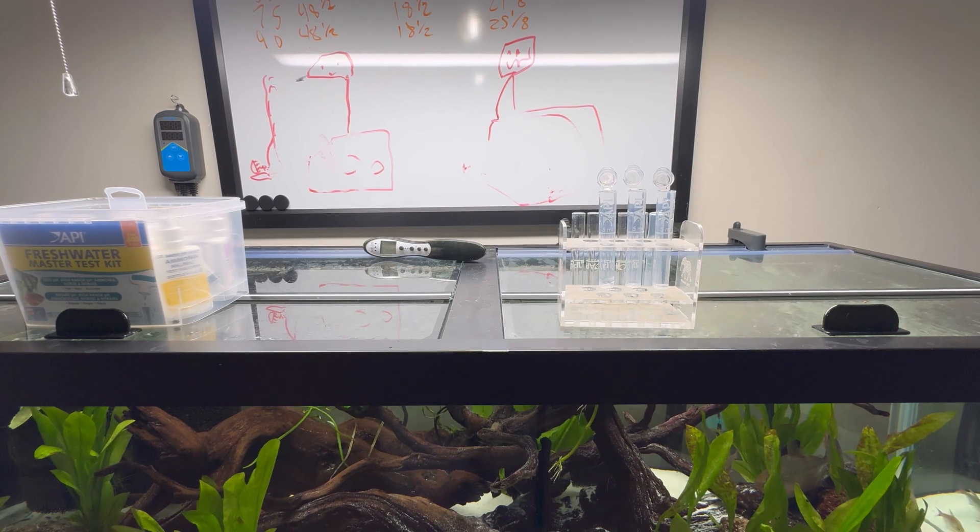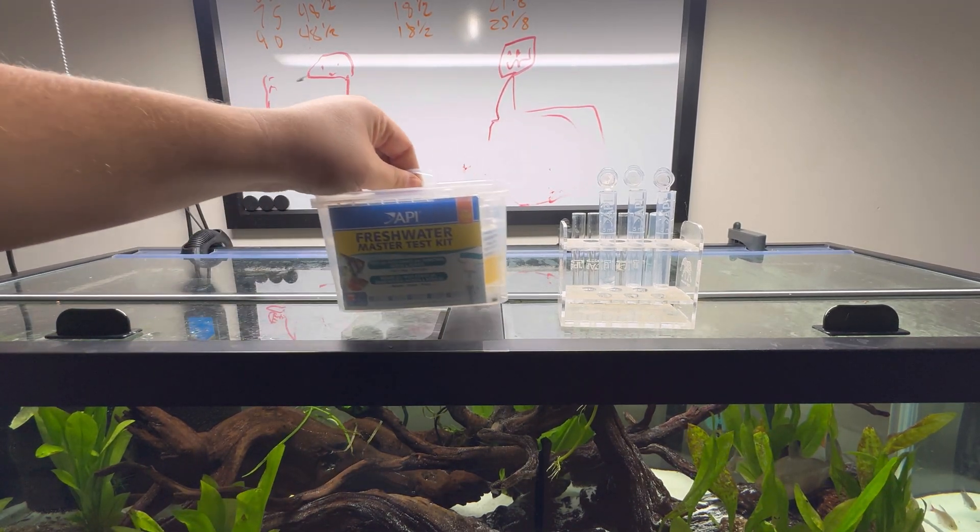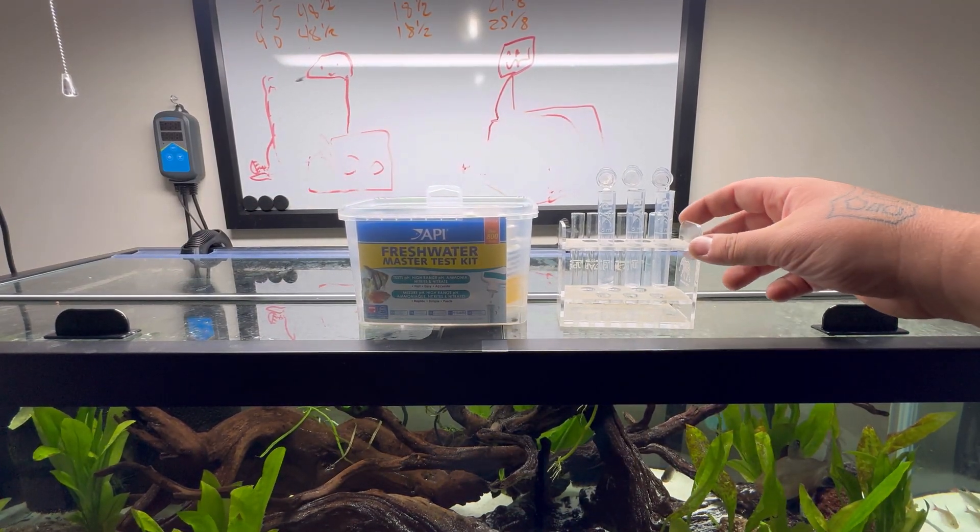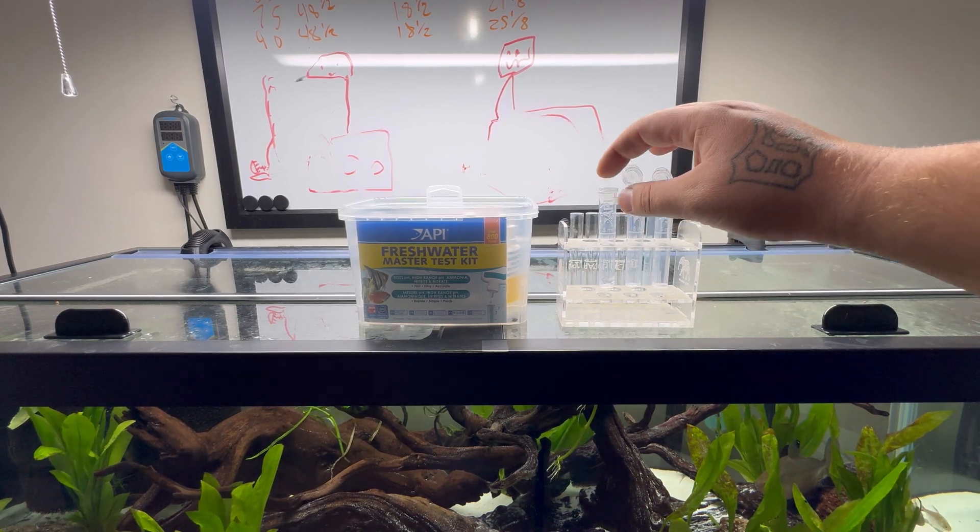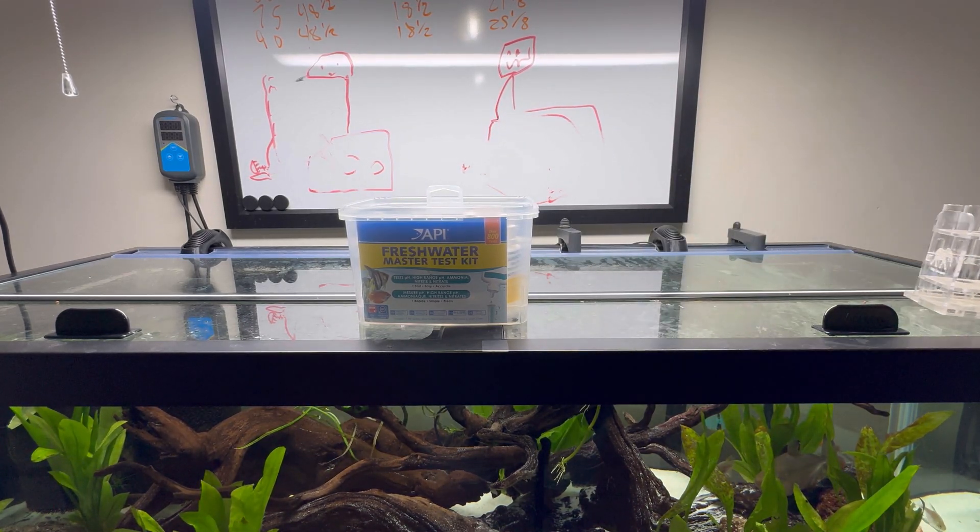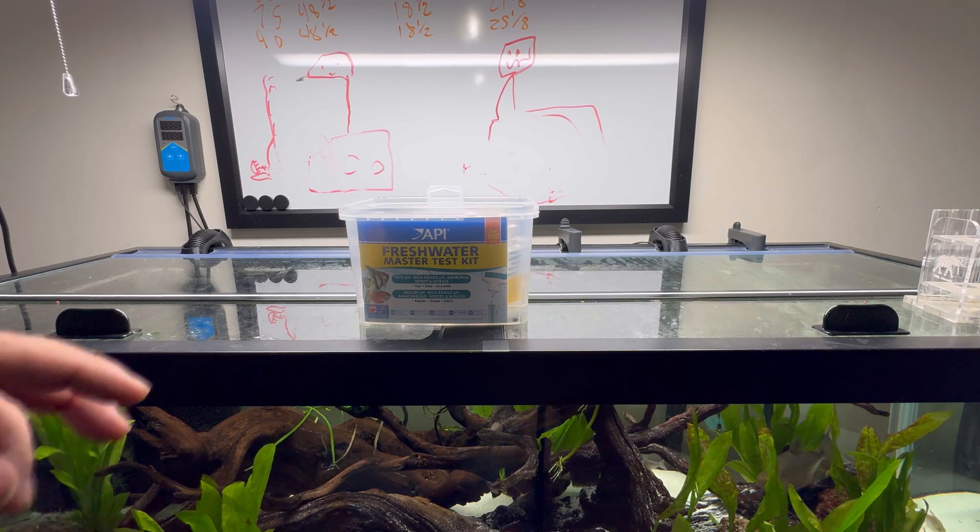Here we are at the tank. I hope the lighting's not too terrible. We're going to jump right into it. We have an API Freshwater Master Test Kit here, the newer version with the plastic vials with the attached lids.